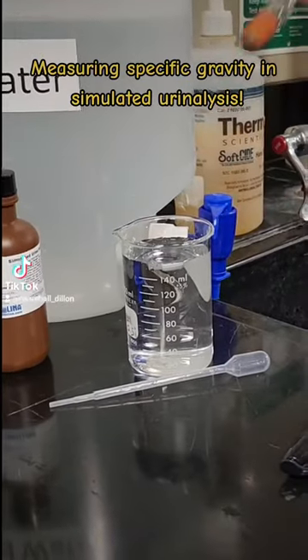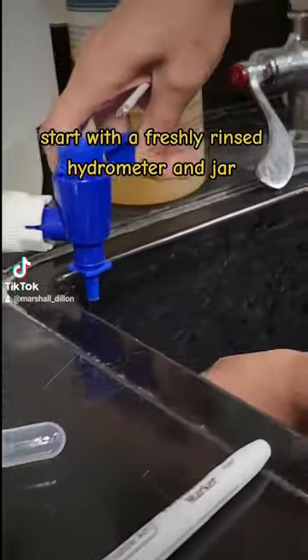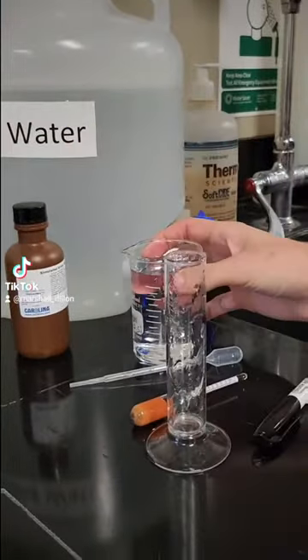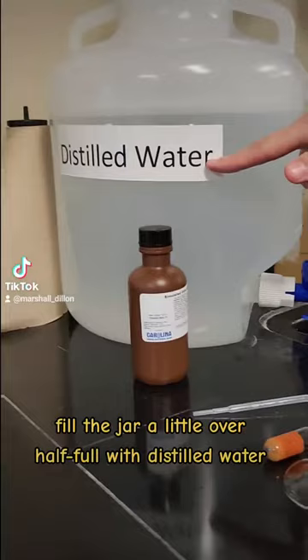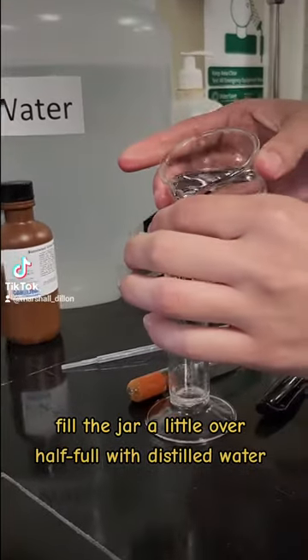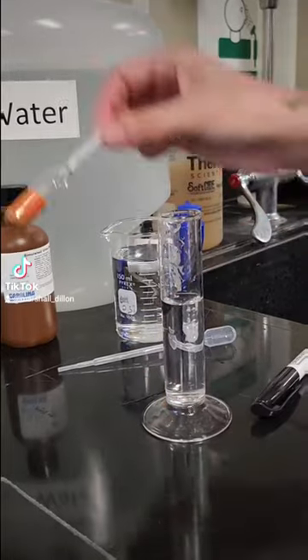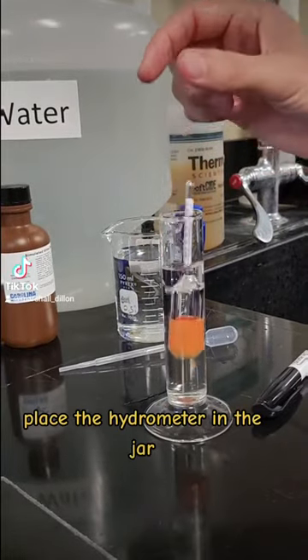Measuring specific gravity and simulated urinalysis. Start with a freshly rinsed hydrometer and jar. Fill the jar a little over half full with distilled water, then place the hydrometer in the jar.